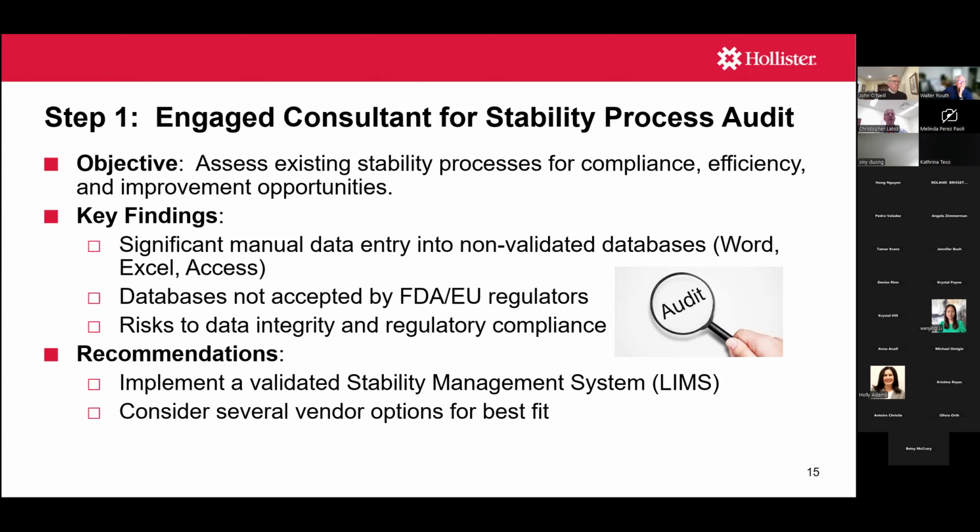So that carried a lot of weight. The consultant recommended that, to shore up things, we really needed to explore some type of LIMS system. And he even recommended a couple of vendors for us to explore.